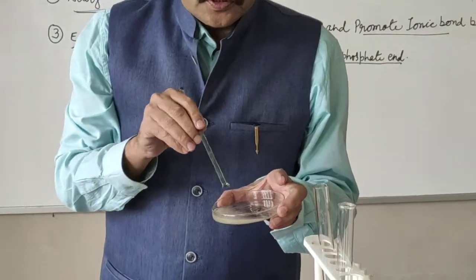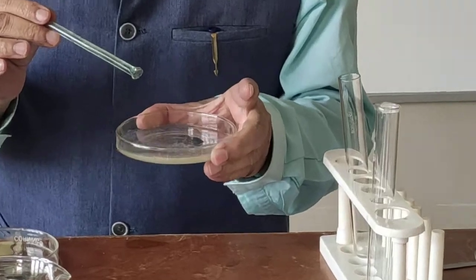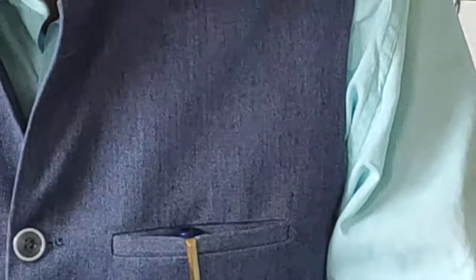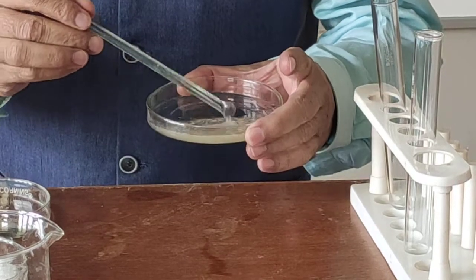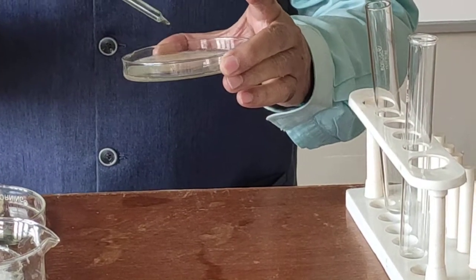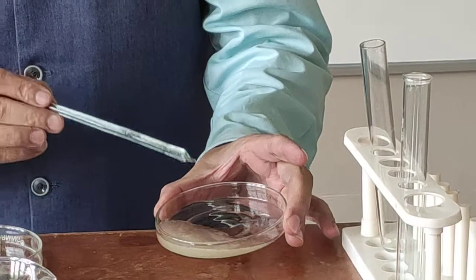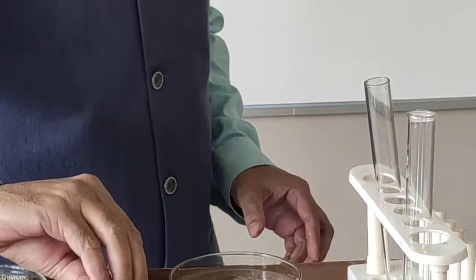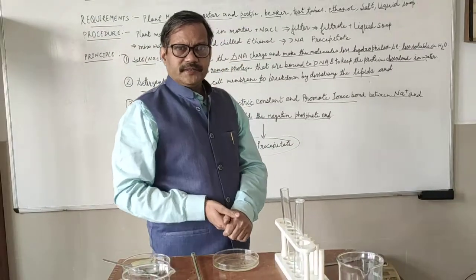This is the DNA precipitate. Find the thread — a fine thread of DNA. The strands separate from the DNA. It is a very simple experiment. We should also have some DNA extracted from the plant. Thank you.